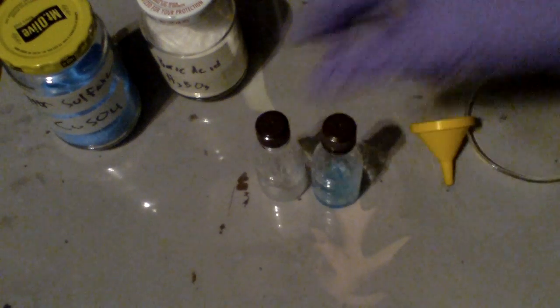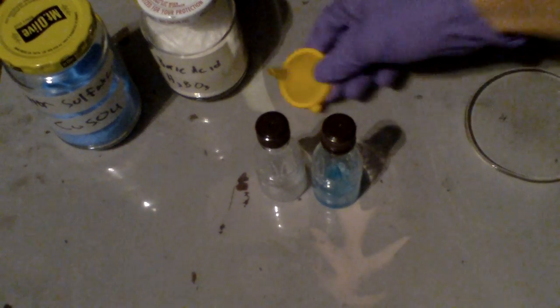Now when you dissolve boric acid in methanol, you make trimethylborate, a flammable liquid that burns with a green flame. So there's actually a reaction that takes place.